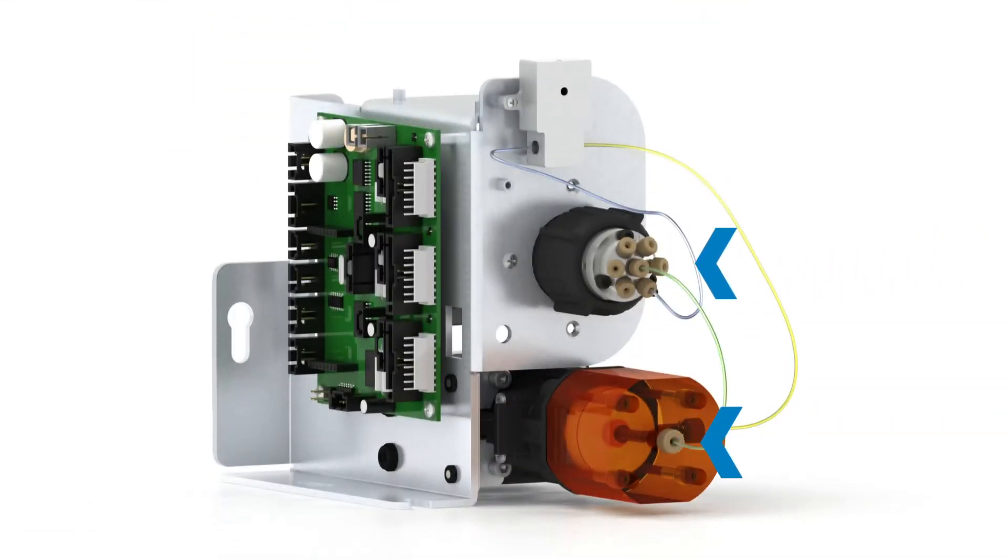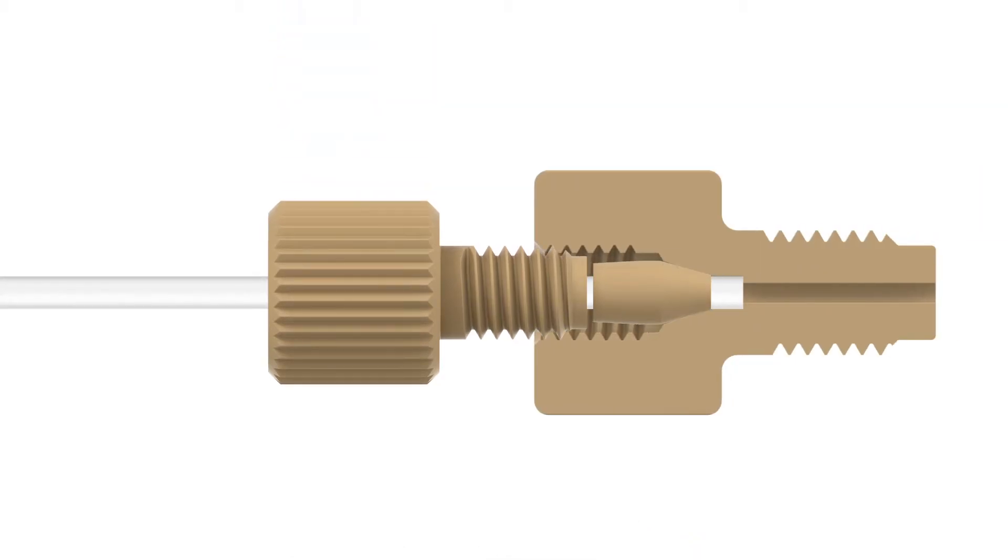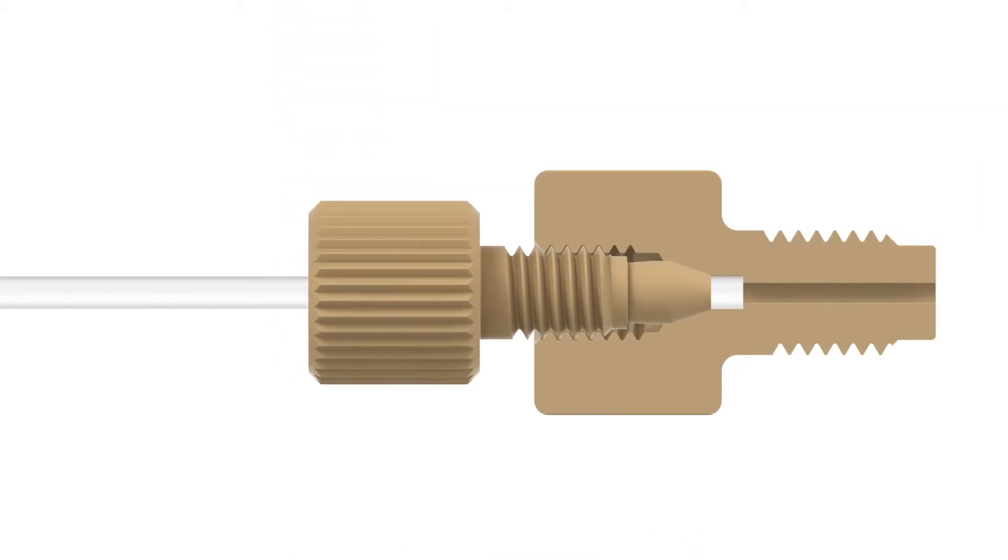The purpose of a fitting is to provide the physical connection of tubing throughout an HPLC system. A ferrule compresses the tubing while a nut provides the driving force that causes the ferrule to seal.